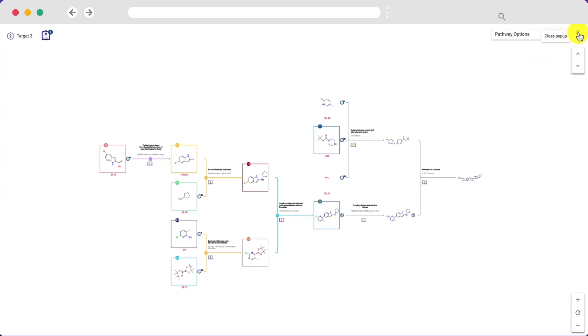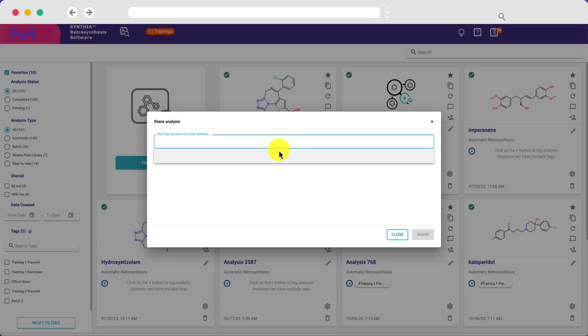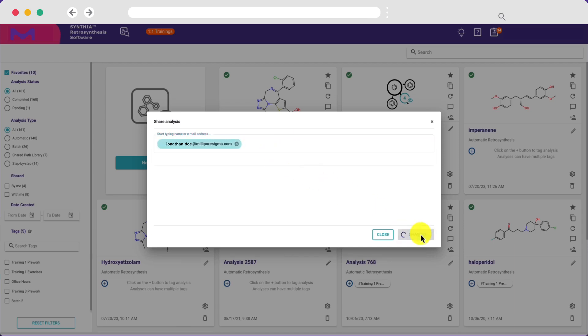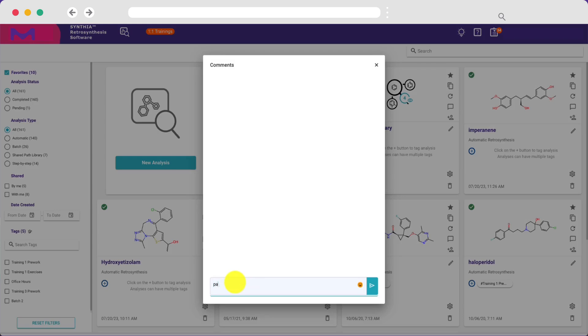Finally, you can easily collaborate with colleagues by sharing a search directly in Cynthia and using the comment box to discuss the results.